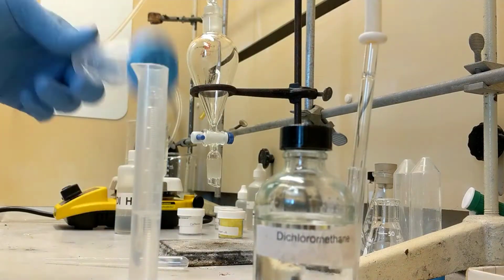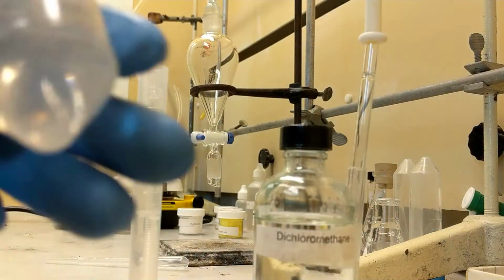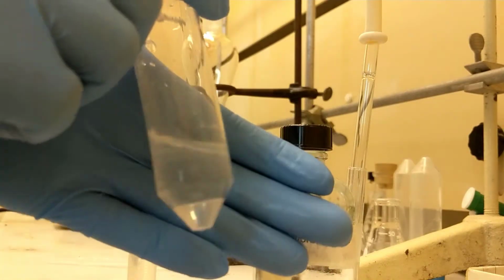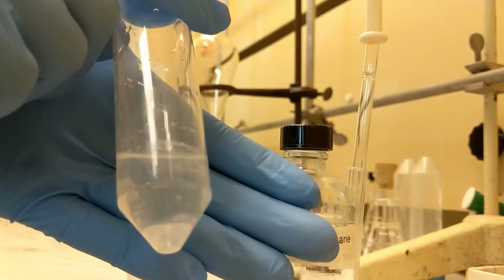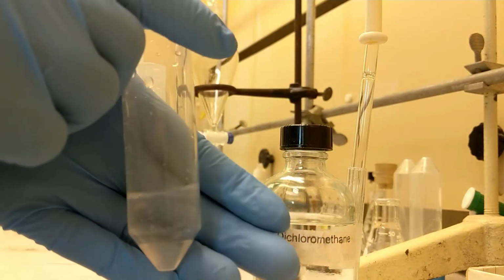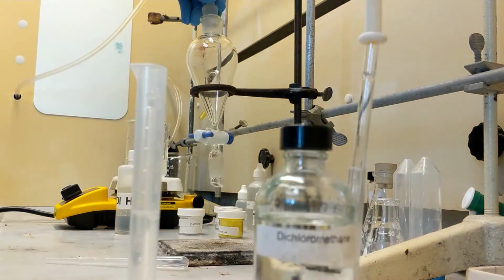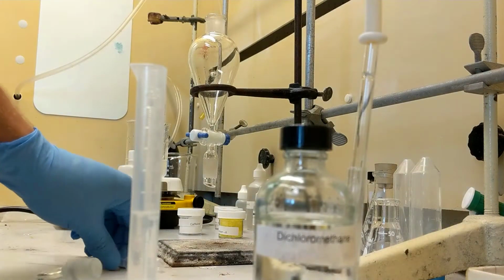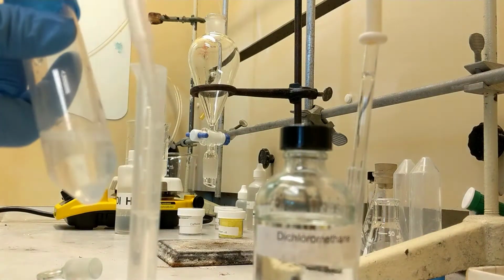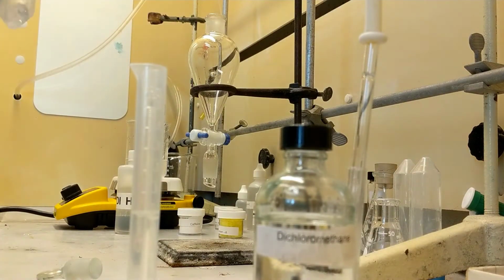Alright guys, we're back. I've been shaking this caffeine water mixture for quite some time now. As you can see, it's a little, hold on, let me get it in frame. It's a little more stirred than it was before. Not as much suspension. I think I got it as dissolved as I'm going to get it. Okay? Now, I'm going to add this using a Pasteur pipette into my separatory funnel.